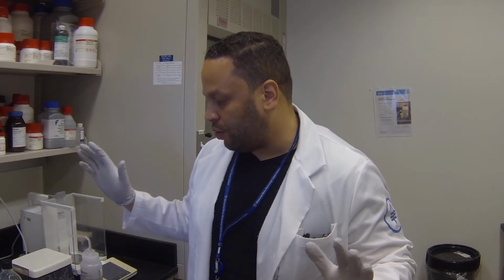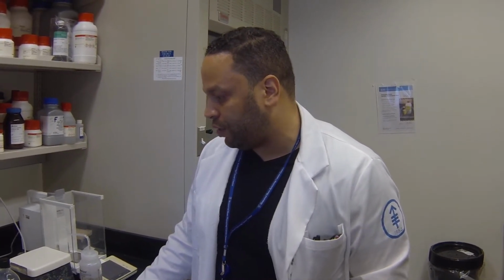We are going to make today a 2 molar calcium chloride solution, which we use to transfect cells, different types. You can put plasmids and different types of nucleic acids in. So it's something that's readily used regularly in different types of labs. What we're going to do today, you can pretty much apply to a lot of things you're going to mix.